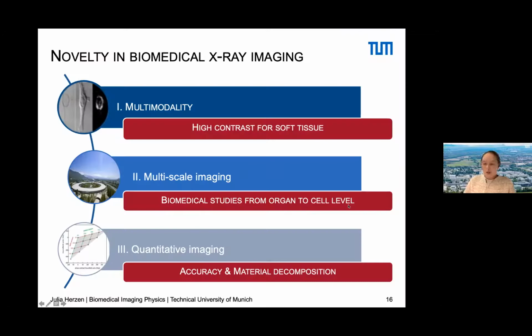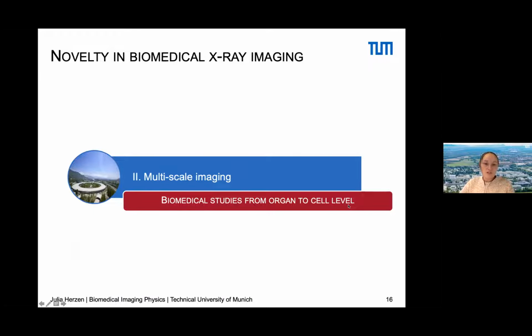Okay, now let's come to the second part, and this is how you can use this approach for multi-scale imaging. So, performing studies to scan full organs or even whole mice down to cell level. And there are some challenges which we need to address.